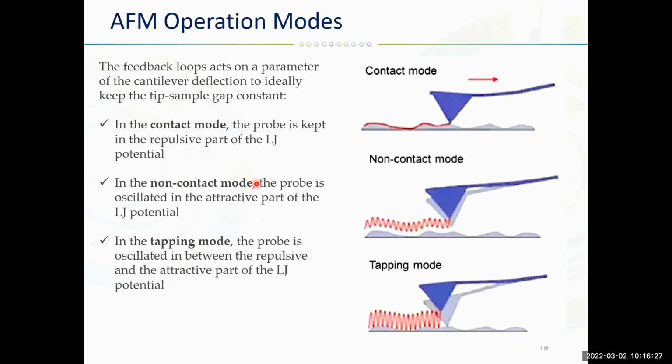Okay, so typically non-contact mode is carried out in the amplitude modulation mode, and the error signal can come either from the amplitude or the phase of oscillation of the tip. It's very important to avoid the different possibilities of slipping or drifting, because otherwise you can damage or contaminate the tip.